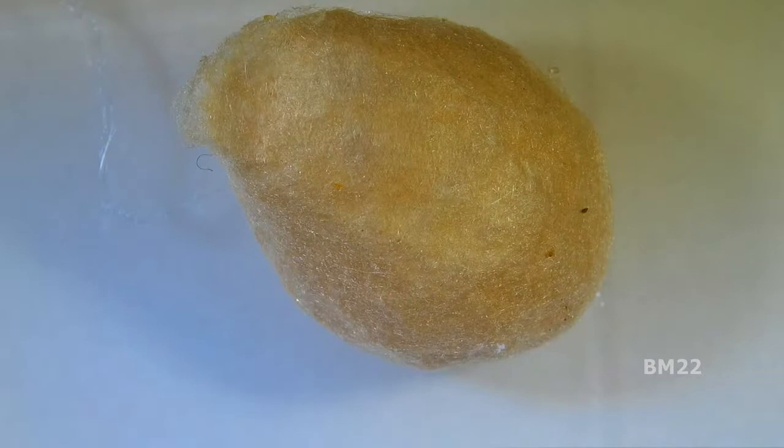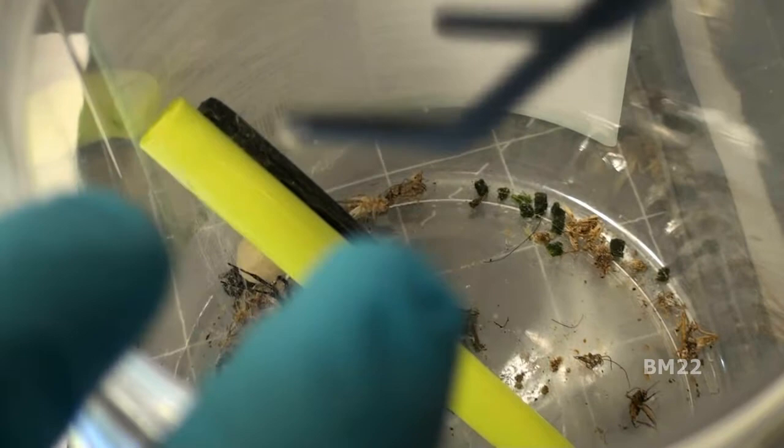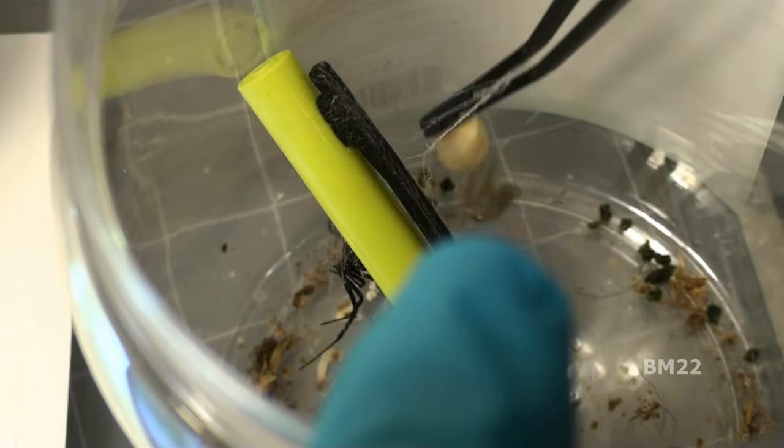Hi everybody, beanmeister22 here. Today we're gonna take a look at that egg sack that the black widow spider we have in captivity laid. I've been watching this egg sack for a while and it's been getting closer and closer to hatching time, which I believe is roughly about 30 days. We're two and a half to three weeks into it, kind of pushing it — and that's just my guess of when I thought it laid the egg sack.